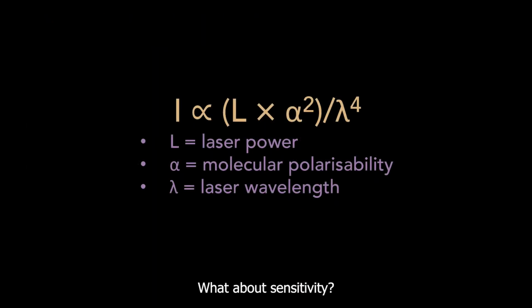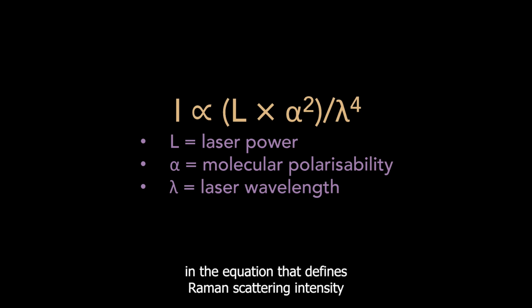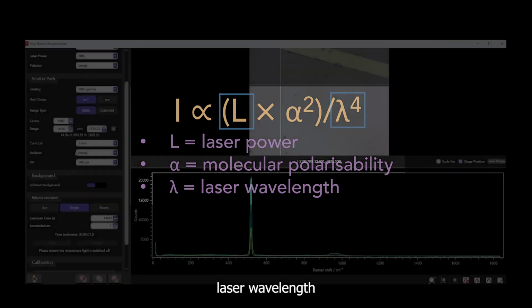What about sensitivity? The effect of the laser on this parameter can be summed up in the equation that defines Raman scattering intensity. The magnitude of the Raman intensity is directly proportional to the laser power and has an inverse fourth power dependency on laser wavelength.